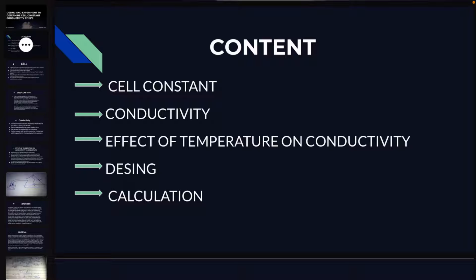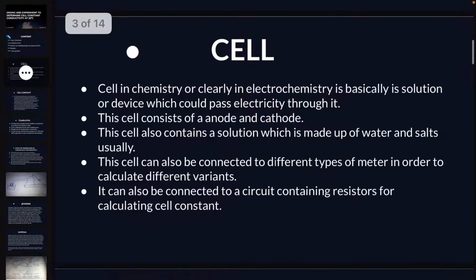So first of all, let's see the contents. Here we have cell constant, conductivity, effect of temperature on conductivity, designs and calculations. So we have a whole bunch of things to study one by one. Let's get to the point and talk about cell constant first of all.